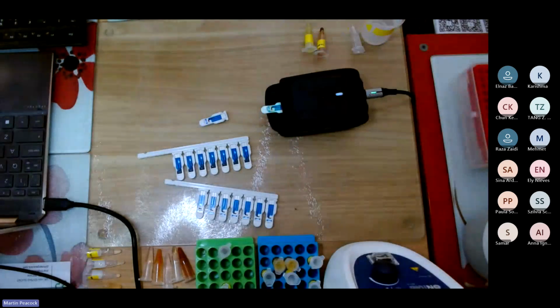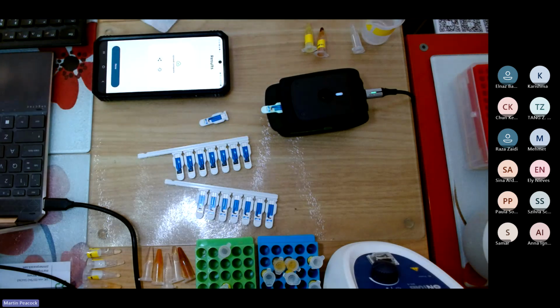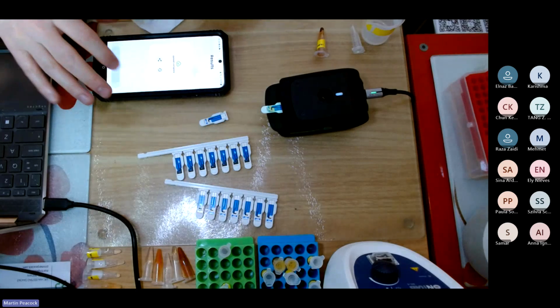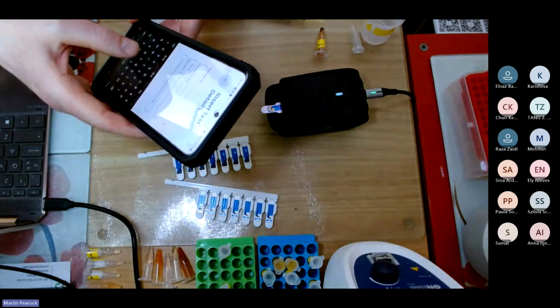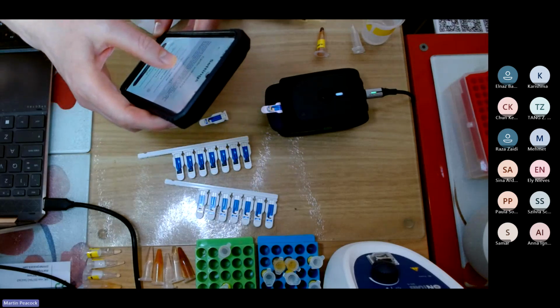All right, so I've done the cleaning step now. You'll see me take that acid off that electrode, and I will then bring 50 microliters of the ferricyanide back to that electrode, and we'll do a final experiment on that. So 50 microliters onto that, which is done. I'm just going to change the conditions back again. I'll call this "after", and then I'll call it ferricyanide, to remind us what that is. I want to start at minus 200 millivolts, which I've done.